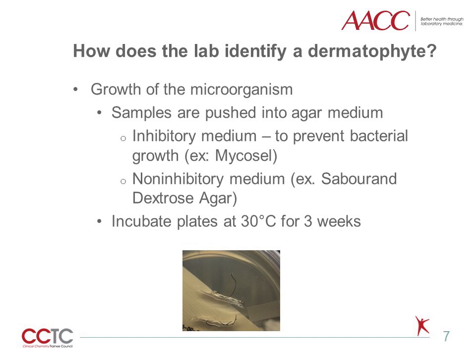Once there is a single mold present, the mycologist can attempt to view the microscopic structures of the organism. This is done by a tape prep, whereby a piece of clear tape is touched to the surface of the mold and then placed on top of a drop of lactophenol cotton blue on a slide. The stain has two functions: to inactivate the mold via the phenol and to stain the structures present. Most dermatophytes have distinct morphology and can be identified through the colony or macroscopic morphology and the microscopic morphology. However, sometimes the organisms don't sporulate or produce identifying structures, and so another method must be employed.